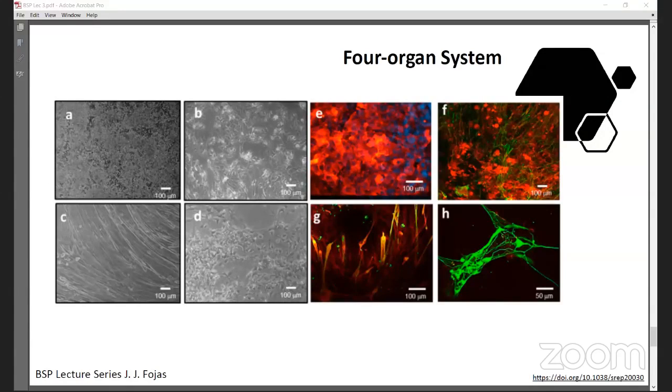The results obtained from this work indicated that this human 4-organ in vitro system is a viable tool to study. So that's one of the breakthroughs for this paper. And you have the organ-to-organ communication. So they prove this. You have drug toxicity, and they have the novel drug compound effects in humans for predictive purposes. So if we can do this with several or hundreds or even thousands of drugs at the same time using just several of these chips, then that would save a lot of money.